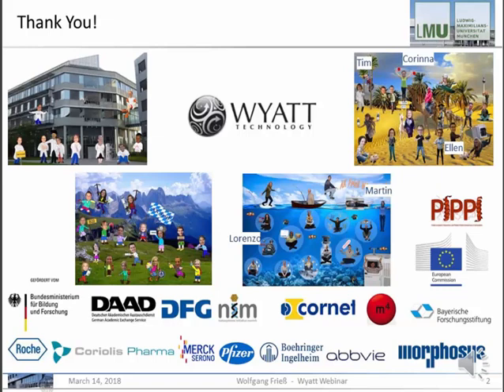Well, we like to look at the combination of all these different parameters, that we know if something, for example, is stored at certainly a temperature which is maybe quite some degrees lower than the TM, and it has strong attractive interactions and a tendency to form aggregates, this may be actually more critical than, for example, a lower TM but a low propensity for aggregate formation.